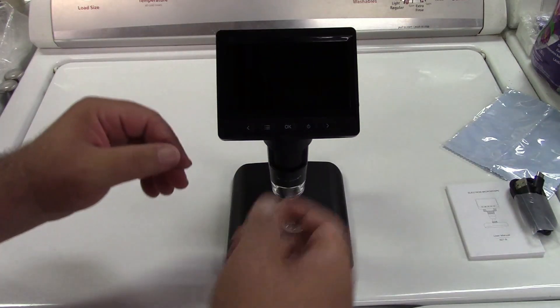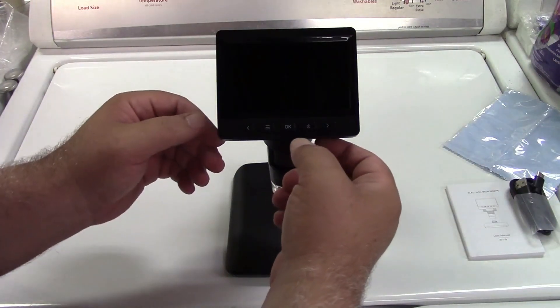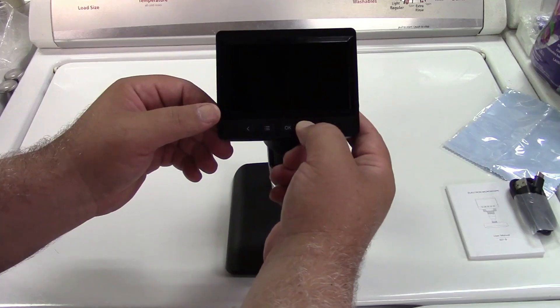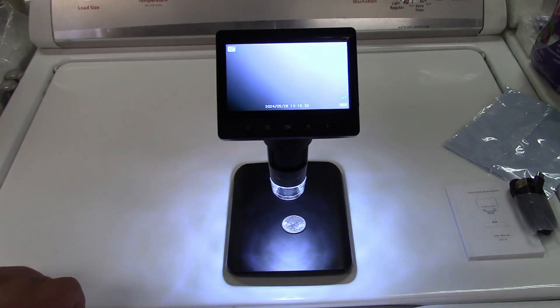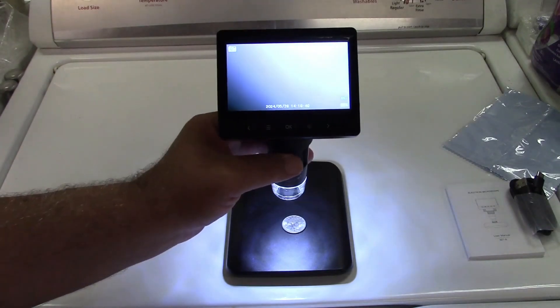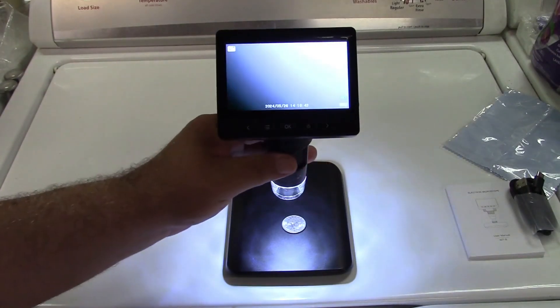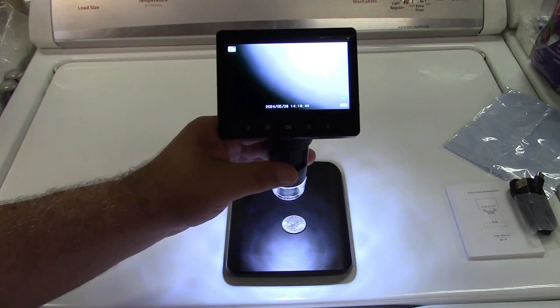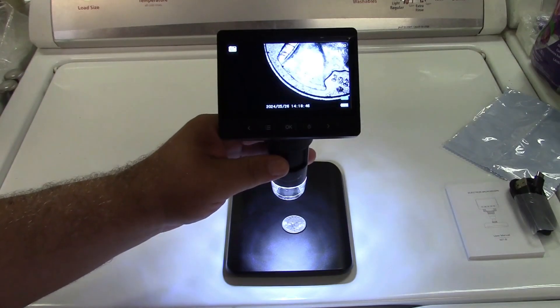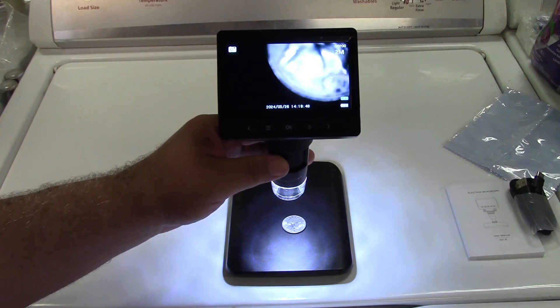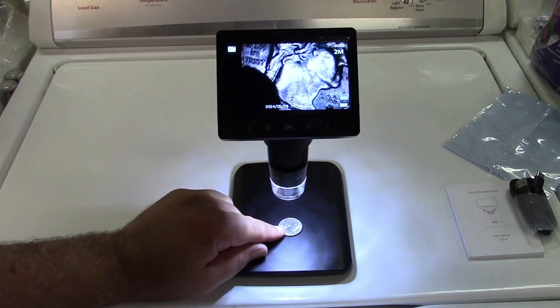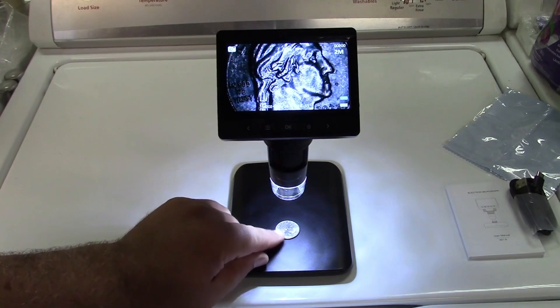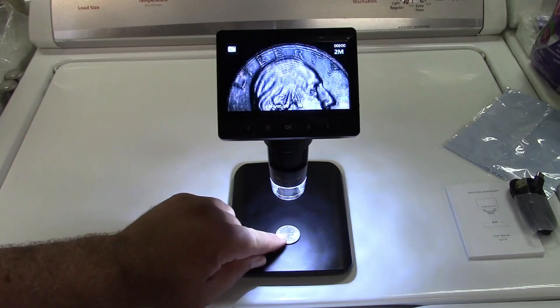Alright, I got a nickel in there. We'll start with that. And we're going to go ahead and turn it on. That's not great. So we're going to fix that by turning the focus wheel. Aha! And get it right in focus. There you go.